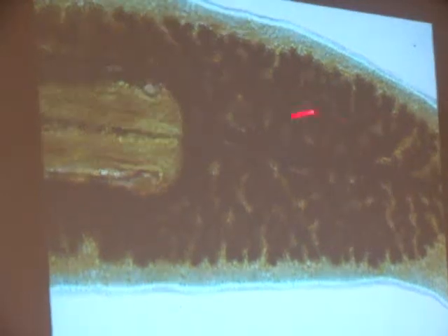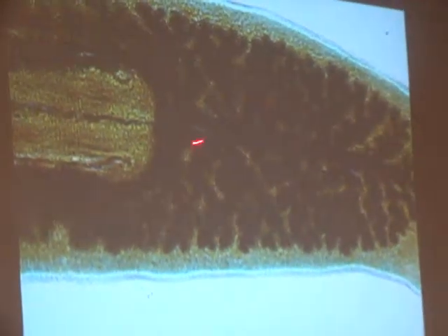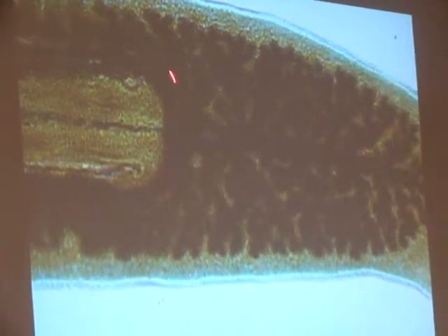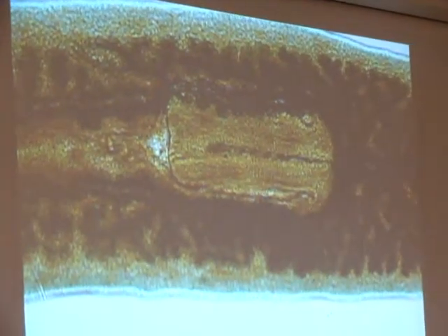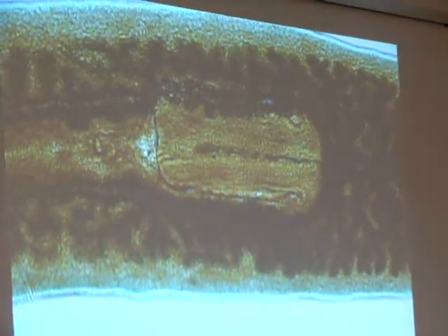Don't let all the puffiness goof you up. So when I drew this for you in lab, I drew it as a simple fork. Here's the anterior portion, and then it branches around and it becomes the lateral branches of the gut. Now the reality of it is it's much more complicated in three-dimensional space, but that's not the point.